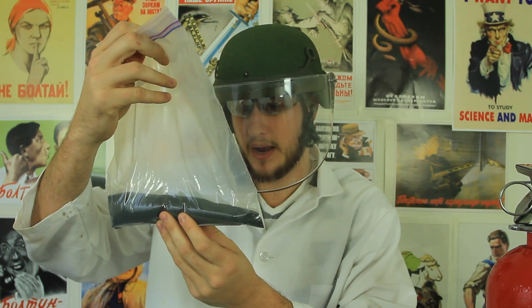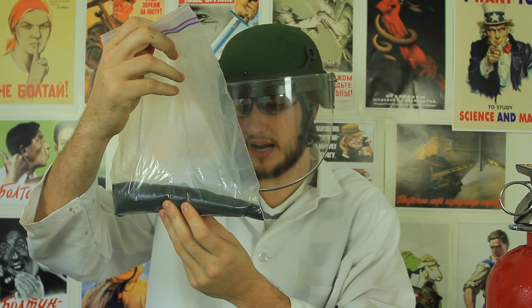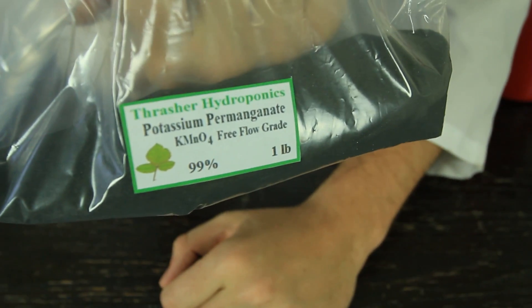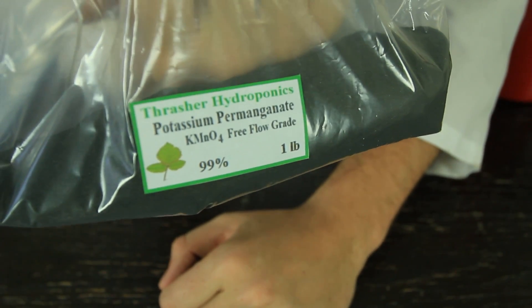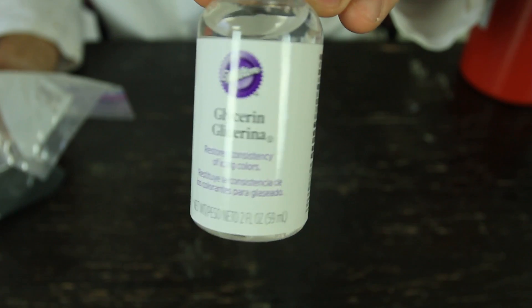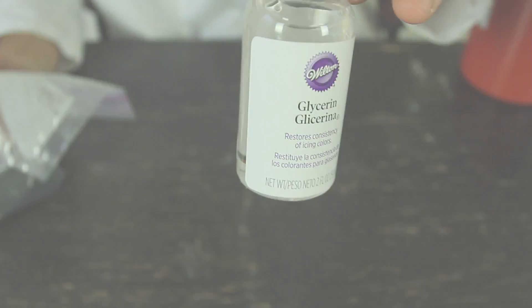We got here potassium permanganate, right here. We're gonna add these two together and see what kind of chemical reaction we're gonna get out of this. As you can see, I got a pound of potassium permanganate. I'm gonna be using only a little bit. And glycerin. So, let's check it out.